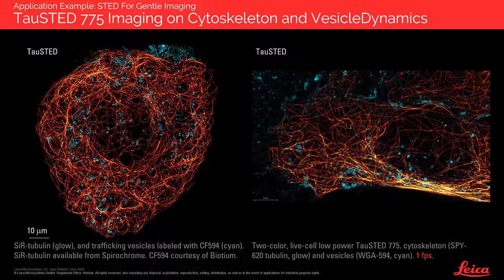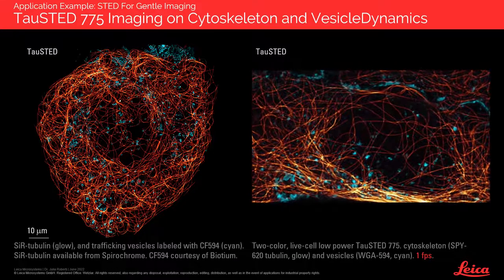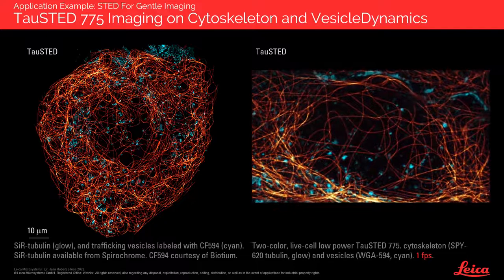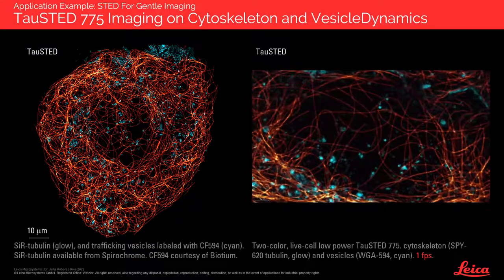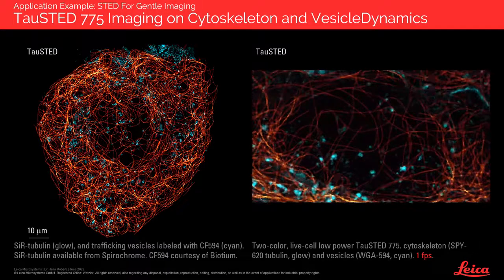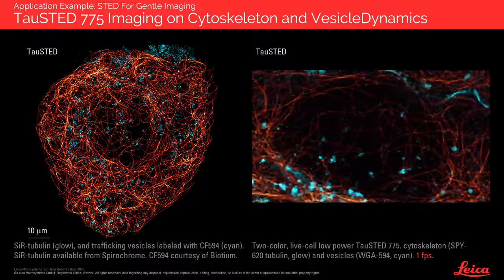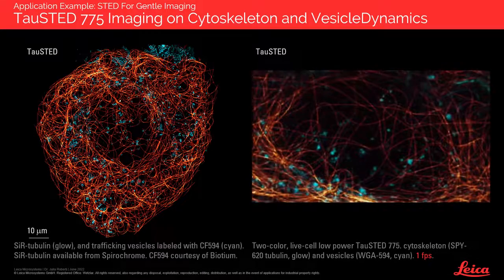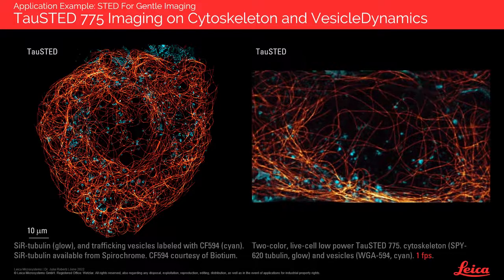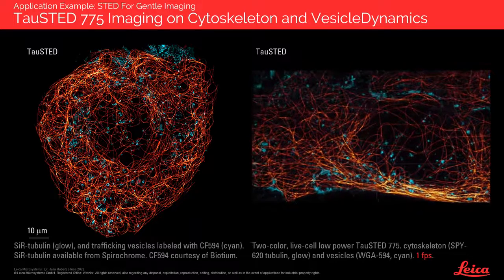We can also apply this approach dynamically, as you can see here, and in the context of STED resolved microtubules. And we can see here dynamically the traveling and the dynamics of the vesicles, and we have the possibility of tracking the vesicles and characterize the motion as they travel along the cytoskeleton.